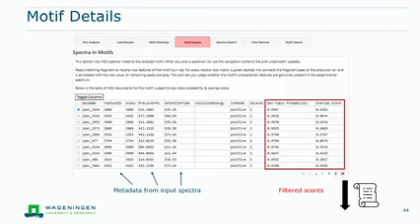You get some metadata from it, the scan number, okay, maybe not too important. Then the precursor, so you know, okay, I have this precursor ion that is related and overlaps with this master motif. I get the retention time, then you get again the overlap score and document probability, and here you can see on the first page that the document topic probabilities are really, really high, all above 0.93. And the overlap scores are in general a bit lower. So again, the sliders from the page before can be used to filter them out as well.